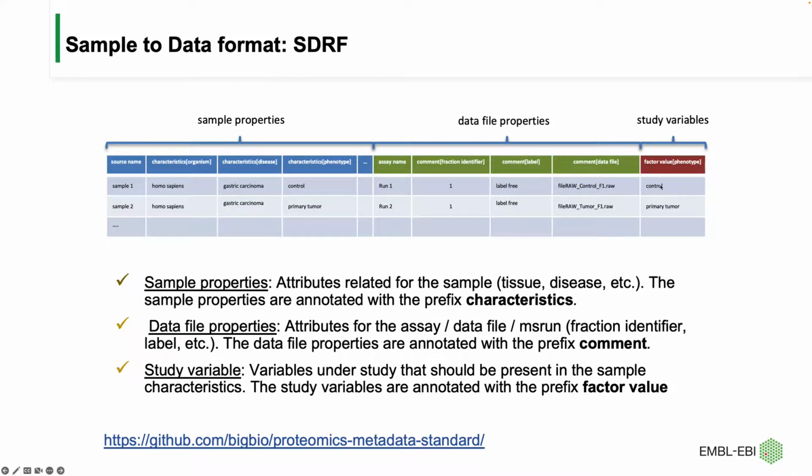And each value of that variable is basically the value of that condition for this particular sample in this particular raw file. It is also important to know that this is the relation. In this case, for example, in the first part of the table, you have sample 1. This is the organism part, and here the column is actually what is the property I want to describe.